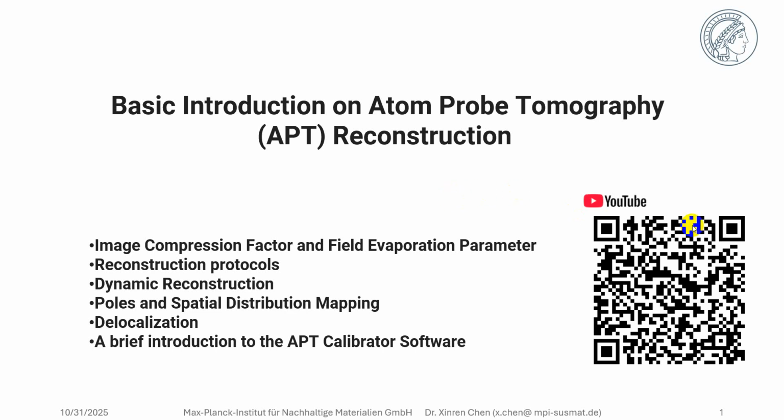Hello, everyone. Very happy to be here to give a very basic introduction on atom probe tomography reconstruction. For beginners in atom probe tomography, and also for old users, sometimes we are curious about reconstruction protocols and what the main principle behind atom probe tomography reconstruction is.